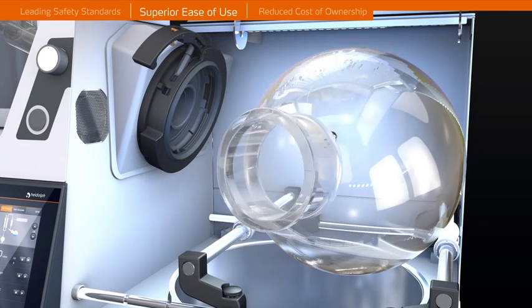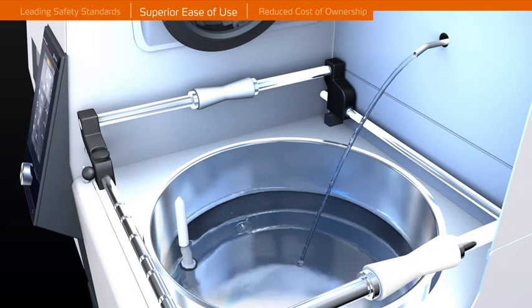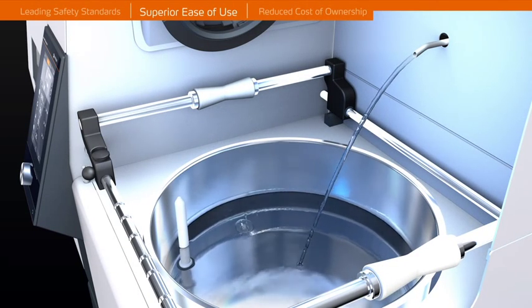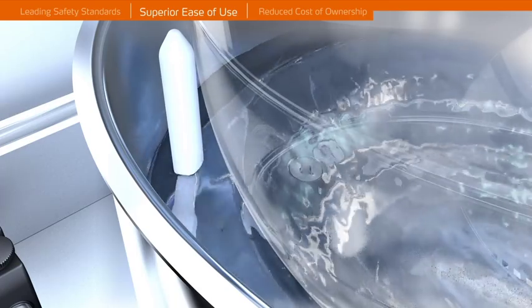The evaporating flask is easily removed and the flask handling system allows for an easy flask change by only one person. The self-filling universal bath ensures you will never run dry due to low fluid levels. Overflow situations are prevented due to an integrated sensor system monitoring the maximum filling level.